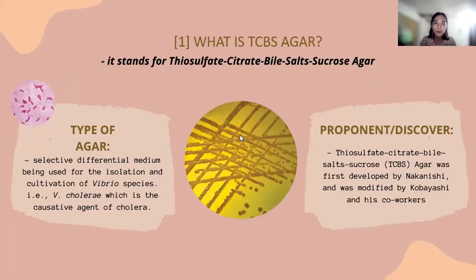So what is TCBS Agar? Again, TCBS Agar stands for Thiosulfate Citrate Bile Salt Sucrose Agar. The name of this agar suggests what its composition is all about. Some of the basic ingredients are given in its name: you have thiosulfate, citrate, bile salts, sucrose, and the agar itself.